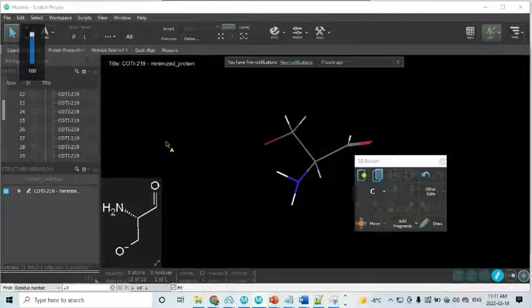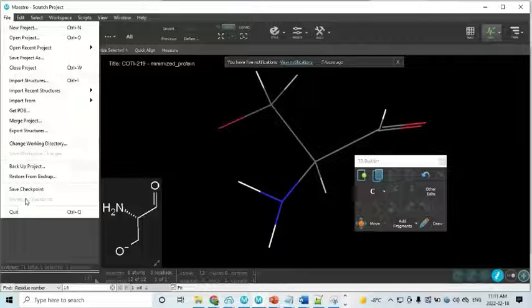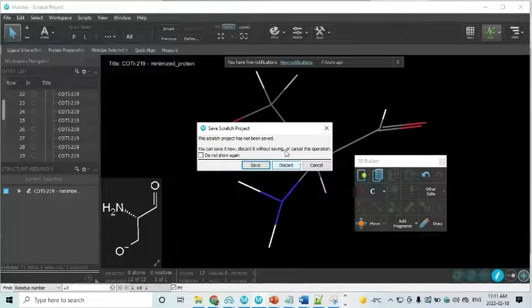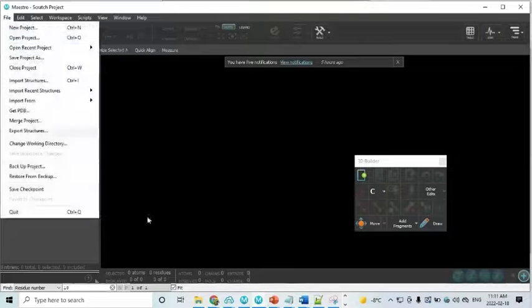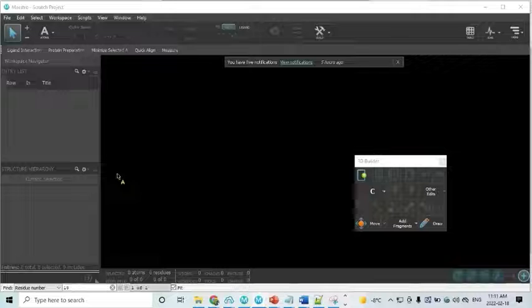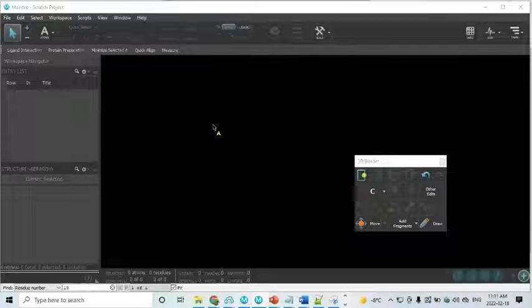So, just let me close this project. So, in the previous session, we actually prepared a structure together, and I mentioned that.